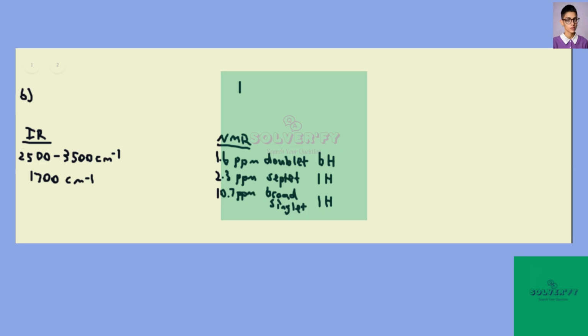Oops, forgot that when I change pages, I have to reselect my color here. So, 1 degree of unsaturation. Again, I'm thinking a carbonyl, and then maybe an ester or carboxylic acid, or we could have another carbonyl and an alcohol like we had last time.